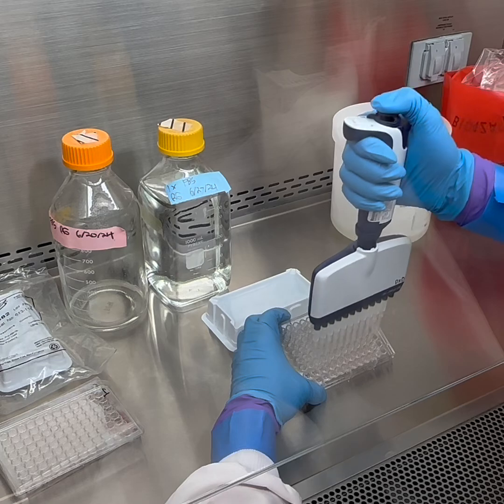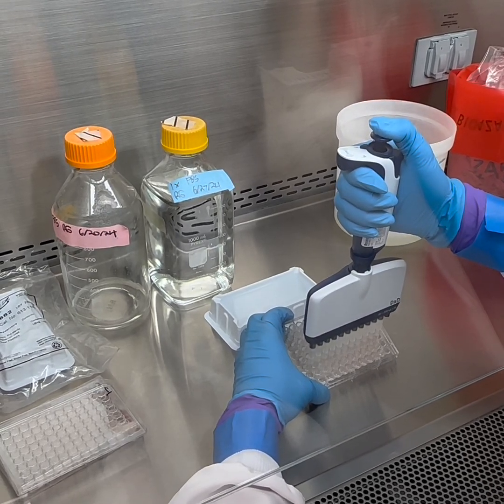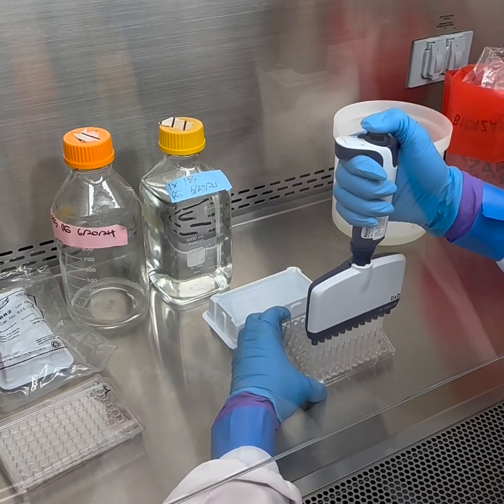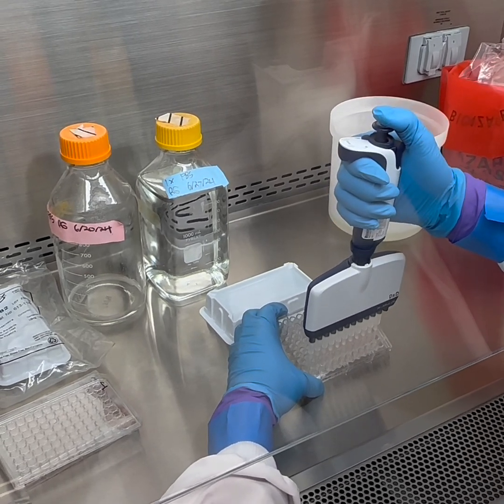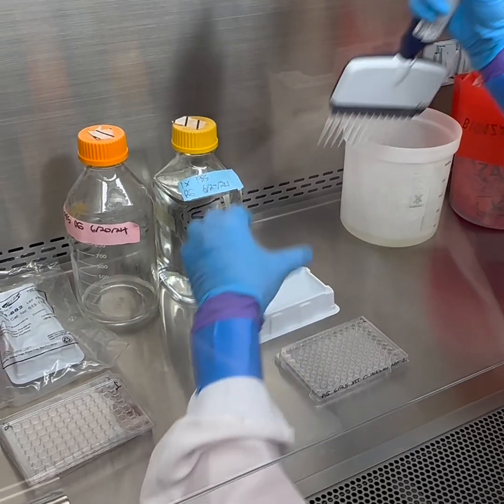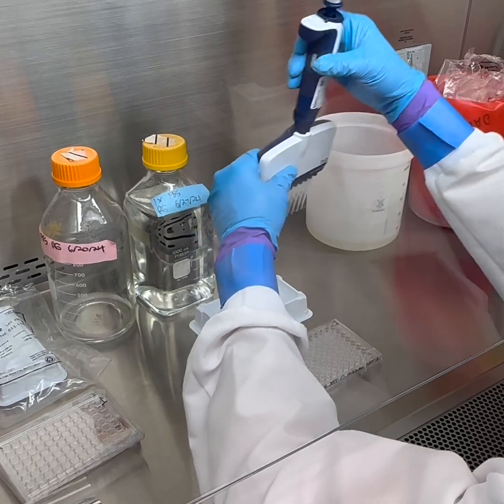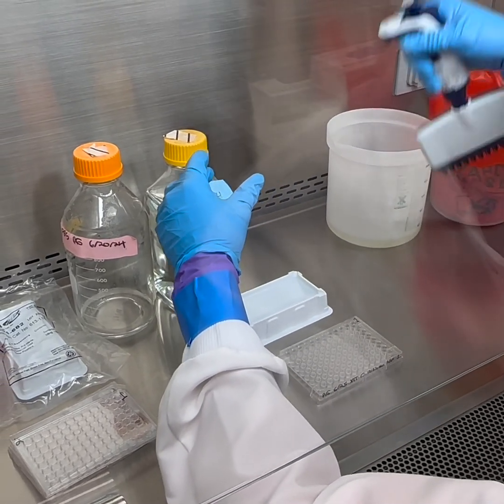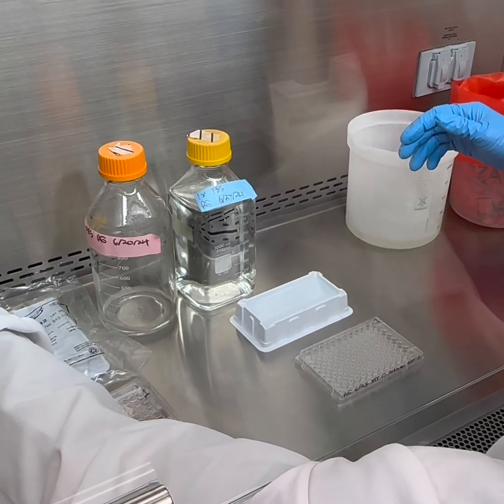And then Hannah will add 100 microliters of XTT. And then we'll incubate for 2 hours. And then transfer the supernatant to a new plate and read it in the plate reader. So, pretty simple. I'm actually going to switch my tips because Hannah's working with doxycycline, and I don't want to contaminate this PBS with my heparin.